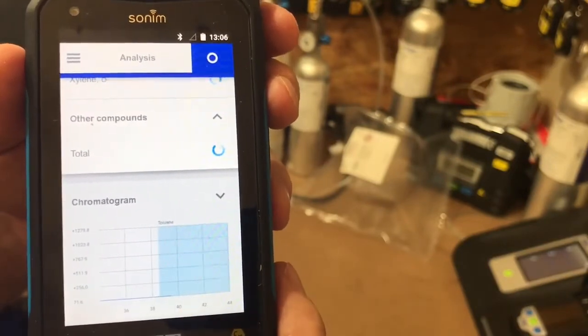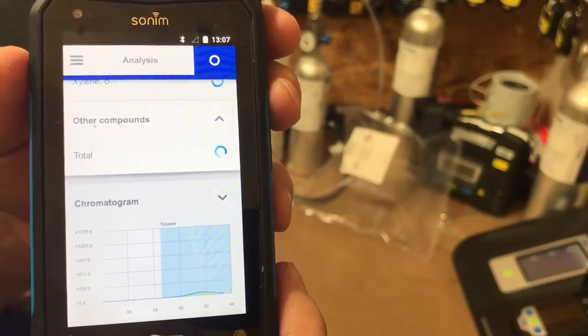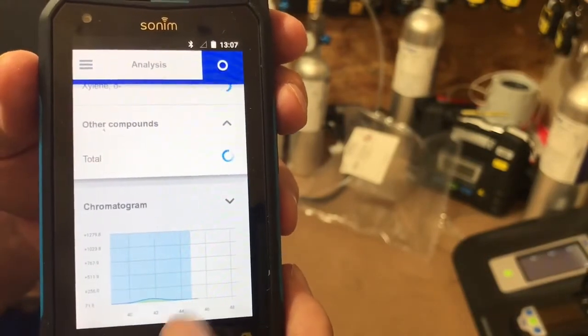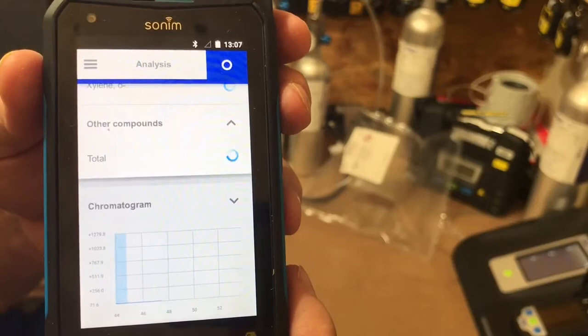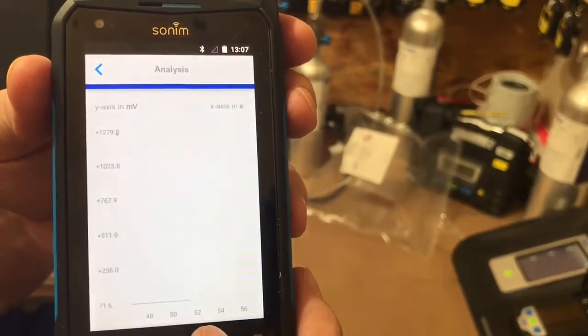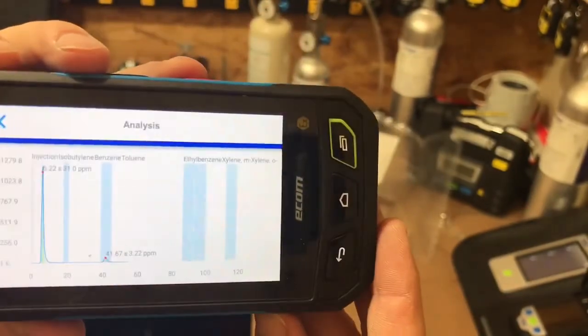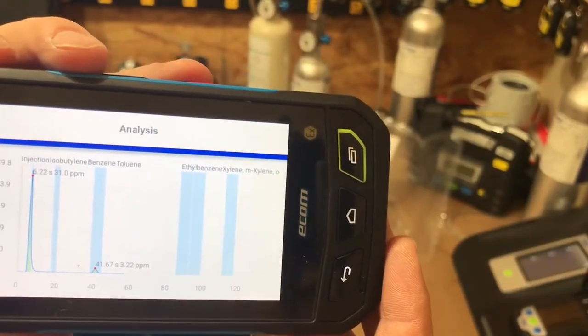Let's catch back up — a little piece of something on there. There's your toluene. There's your rise right there. I think we can make this bigger. There we go. Turn it sideways. Oh, look at that.